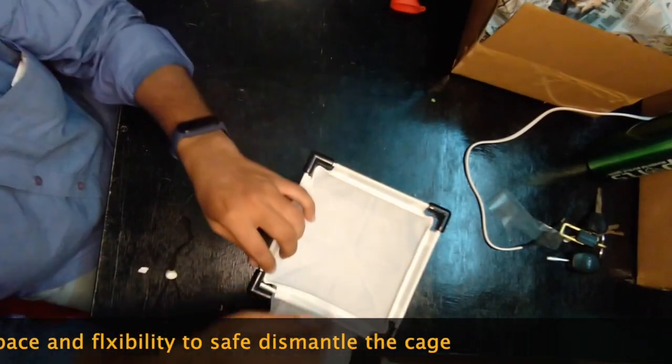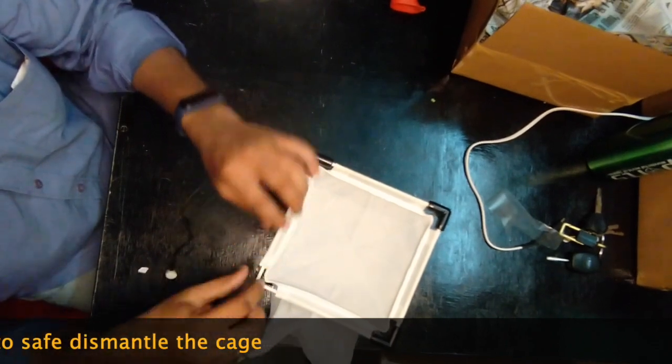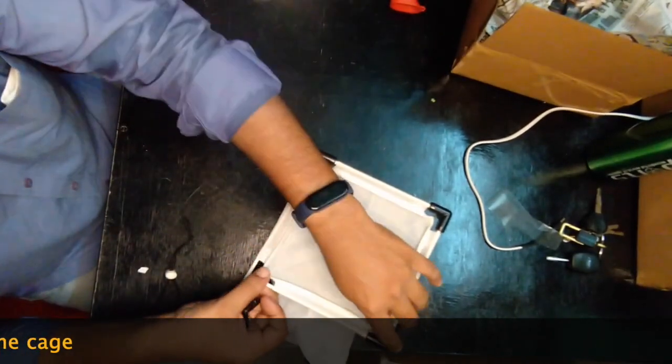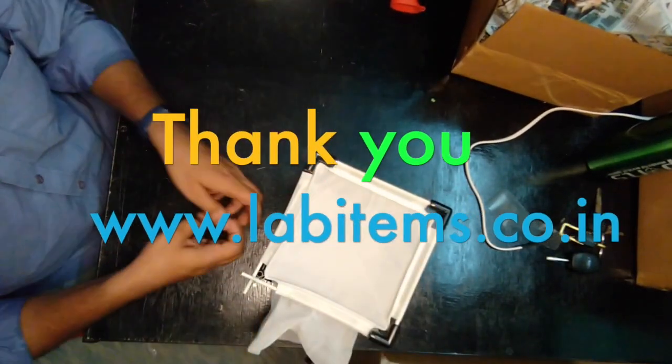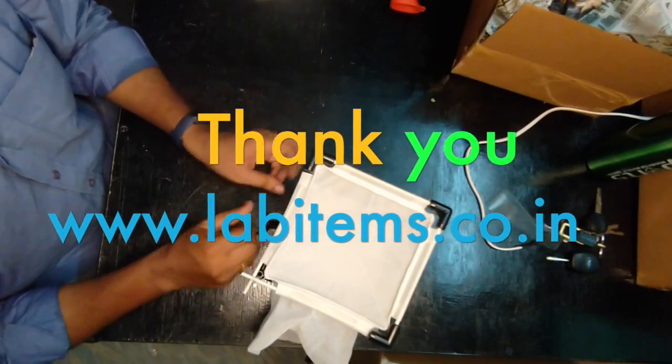If it is not coming, again try the other side. If you cannot pull it, do not force dismantle the cage. If this is the difficult place, just leave that and try to dismantle other things. This way you can dismantle the cage.